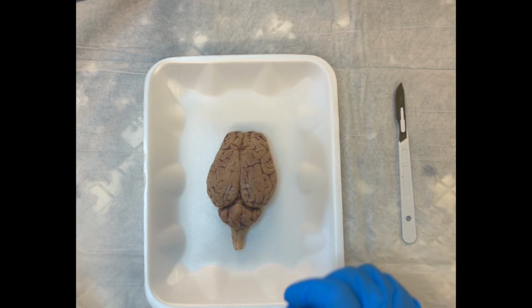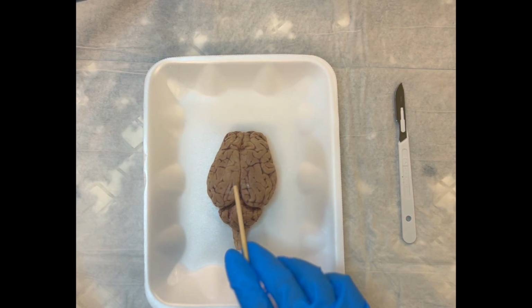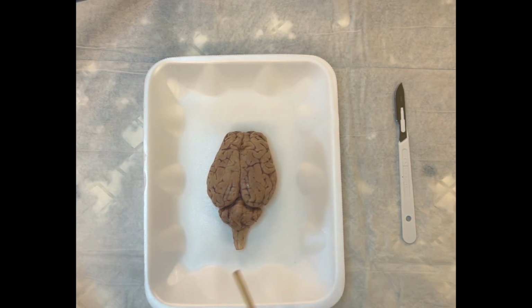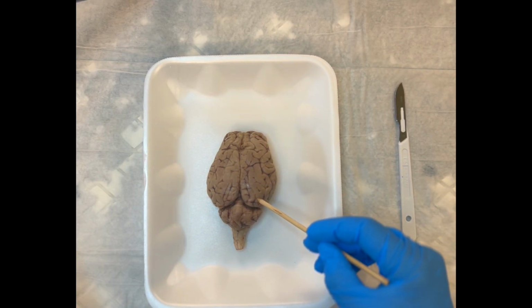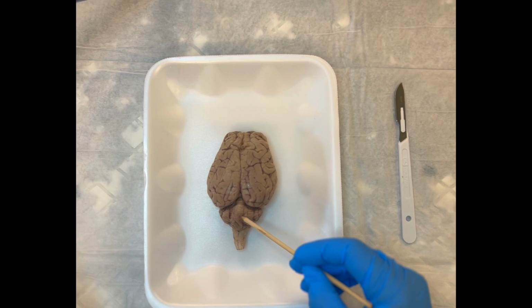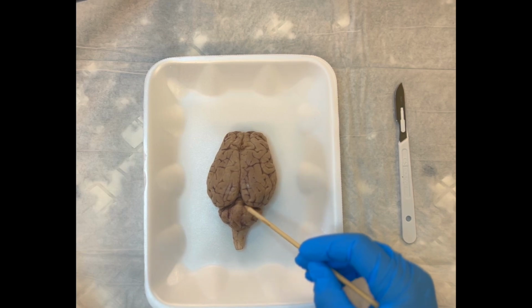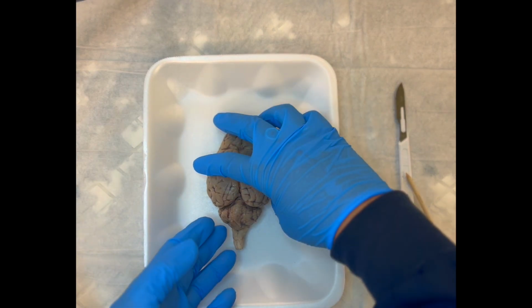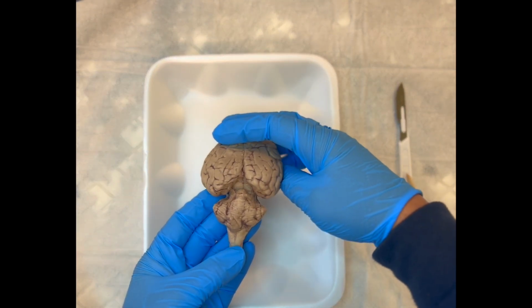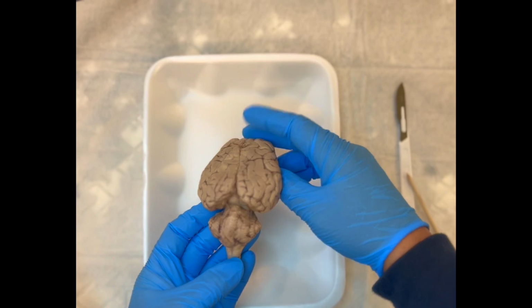All right. So I first want to point out that we have a very distinct left and right cerebral hemisphere. So as a whole, this is the cerebrum. Then we have our little brain back here, the cerebellum. So notice that the cerebellum and the cerebrum, they're quite separate from one another. You can lift it up and really notice how they are isolated structures.